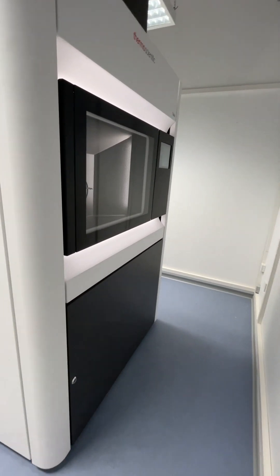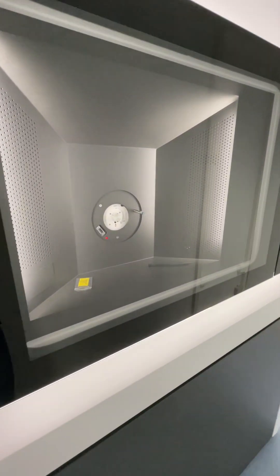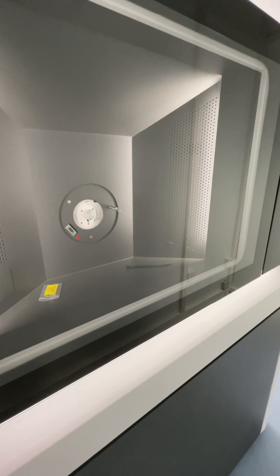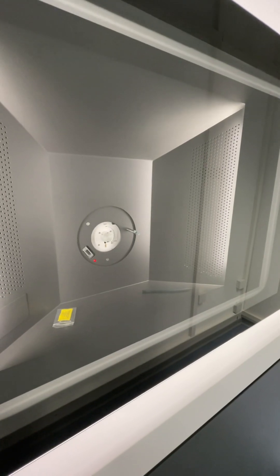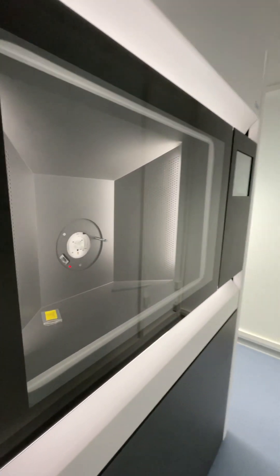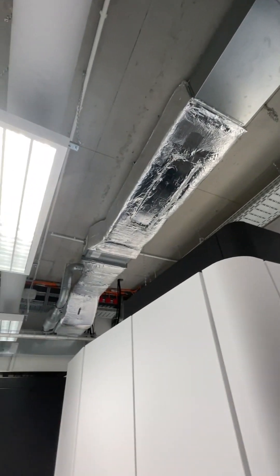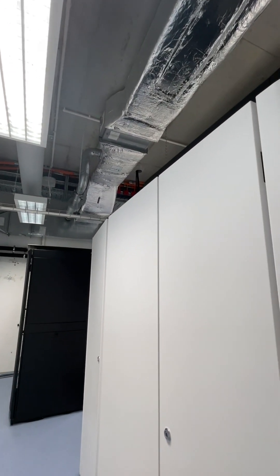We do want to see the microscope, because that's what the tour is about. I'll open the side so we can see the column. The idea is users come in, load their sample, and then go back to the control room. Our control room is actually above us because we're in the basement and the control room is on the ground floor.